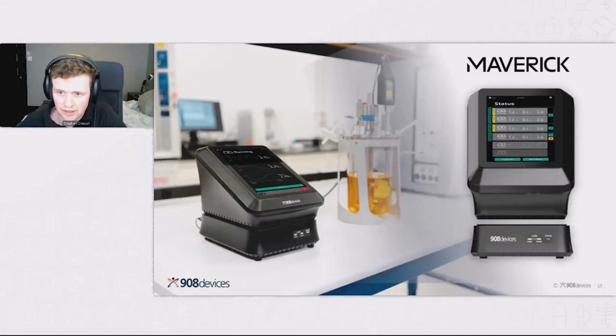This is a picture of the device here. On the top right, we have the measurement hub. That's where you can see all of the data, and it's coordinating all of the measurement modules, where I'm just showing one of those below the hub. You can actually have up to 6 of those measurement modules connecting to the hub, and those 6 measurement modules can be recording in 6 different bioprocesses. I'll go over a bit more of the specifics of the device at the end of my section here, but I just wanted to show you the device.